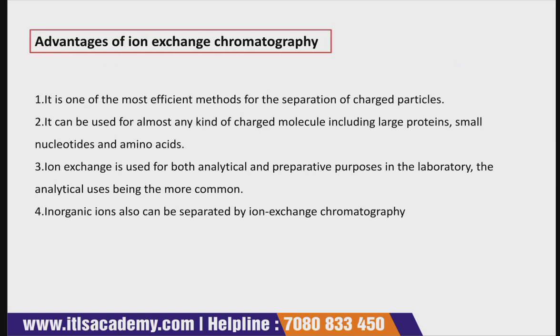Then comes the advantages of ion exchange chromatography. It is one of the most efficient methods for separation of charged particles. So whenever you want to separate a charged particle, this technique is one of the most efficient methods.